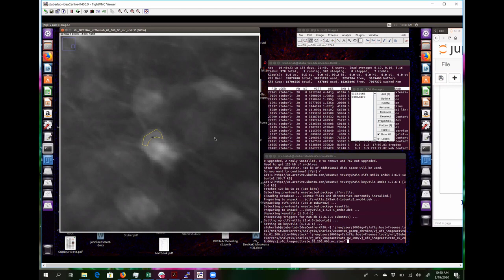Yes. Every session that I draw ROIs for, I also look at the movie. Every single session. That's to make sure that none of the cells that I drew overlap, or that I haven't missed cells and things like that. So in general, if you're unsure and you want to be as close to reality as possible, then you want to look at the movie and figure out exactly where the cell's area is. In this case, I'm pretty certain that it's not as large as this.